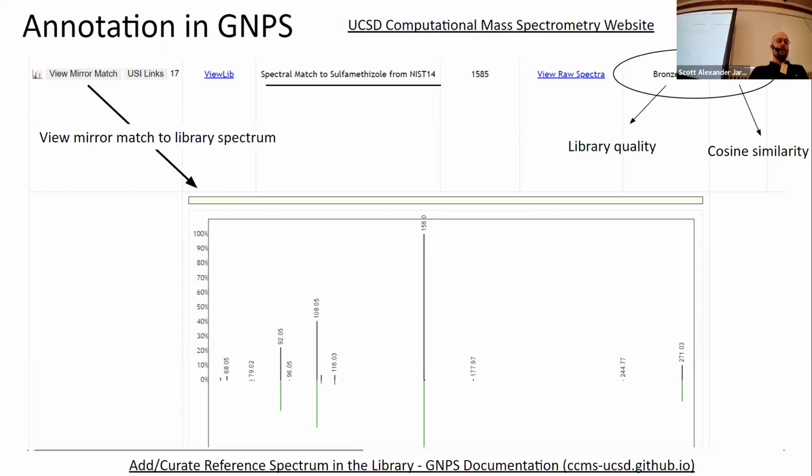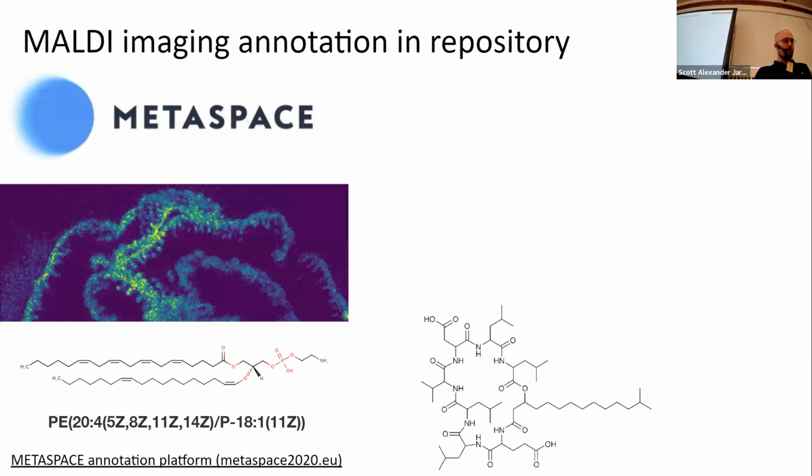There's also a quality that is a challenged spectrum, which is meant to say anyone in the community can annotate. You think it might be related to something, but you're not entirely sure. I honestly have not seen very many challenge spectra in the database, though. I don't know how many there are, but there is that level as well. And then to wrap up, just two more slides.